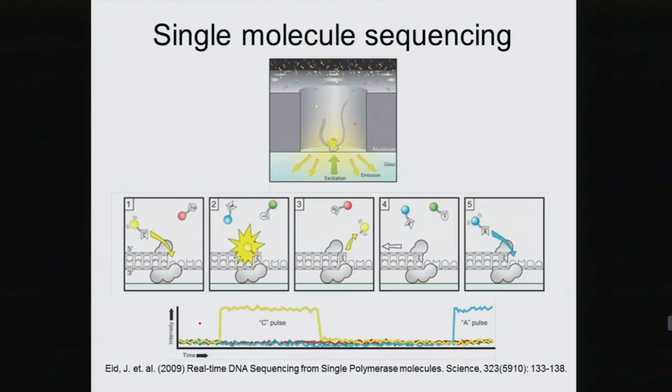Okay, so the key thing about these methodologies, we're going to go through the three of them: the single molecule, the proton, and the pyrosequencing. Don't worry about the complexities of how these readouts are obtained, but rather the principle behind them. Okay, so again, we can think of DNA replication. We have our polymerase, we've got our template strand, we've got our primer.